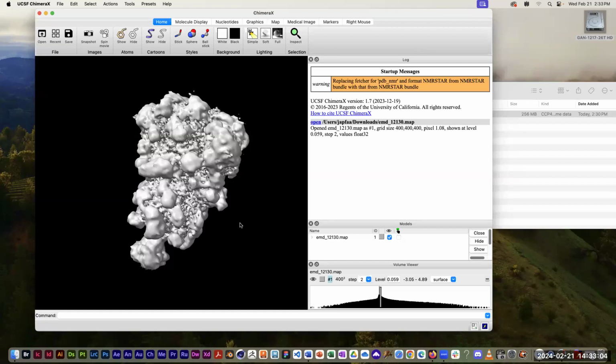There was a picture of a thing called a perforin, which is this protein complex that punches holes in cells. And the raw images themselves were very grainy. Even though Cryo-EM and Cryo-ET had pretty high resolution, they could see very, very small things, the images themselves are very fuzzy and very grainy. So there's a lot of noise in the images.